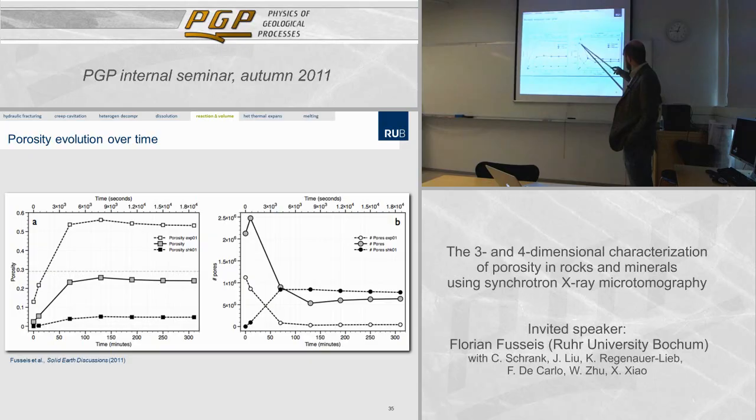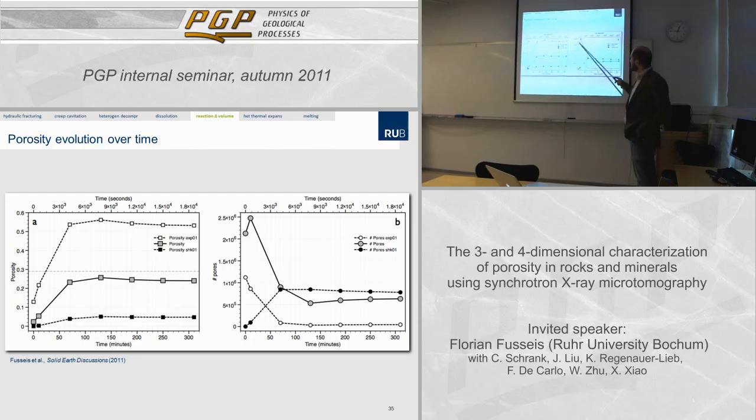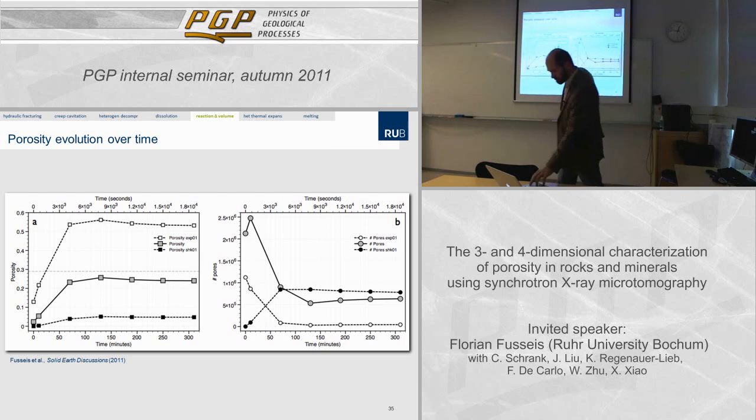I don't know. What we also can show here is the evolution of the sheer number of pores in that volume, and we see that, despite there being hardly any porosity in the original material, there's a very large number of pores. That must mean there's a very large number of very small pores, which then decreases, and as soon as the front has left that particular sampling volume, stabilizes somewhere.